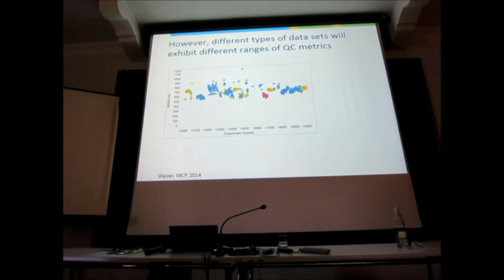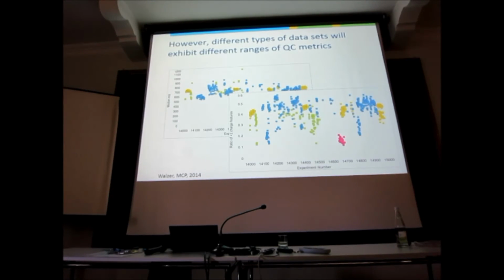Now you can set it for the yellow stuff, it should look like this, right? This is a different metric, and this is a much less useful metric, because for some of the experiments it's all over the place. Unless all of these experiments are complete crap. No? Now, before you start going through the papers from Ghent and thinking that they're all bad, this is actually a standard sample that they ran. So it's not a real proteomics sample. But it's different standards and different protocols.